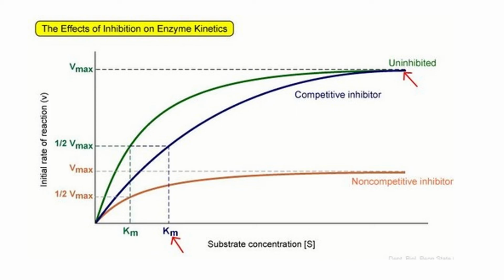That's the idea of the kinetics assay. We really just want to see how these lines end up looking when we have it uninhibited versus when we have it inhibited. If you have any questions about the actual experiment, let me know.